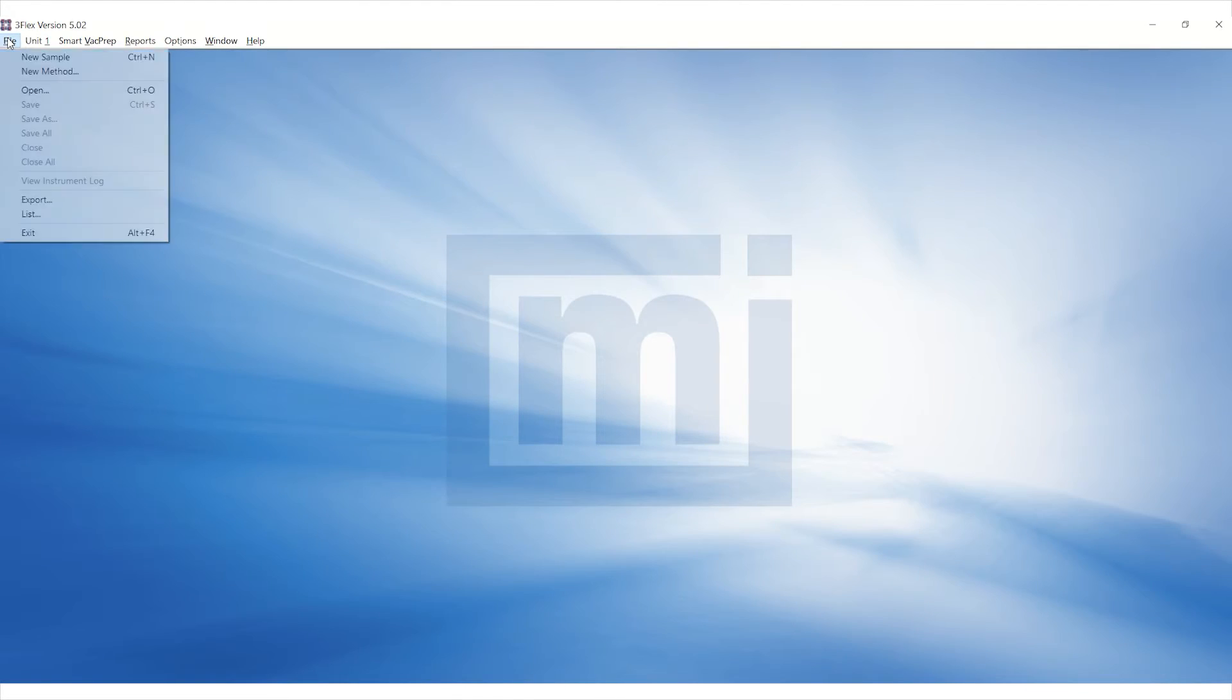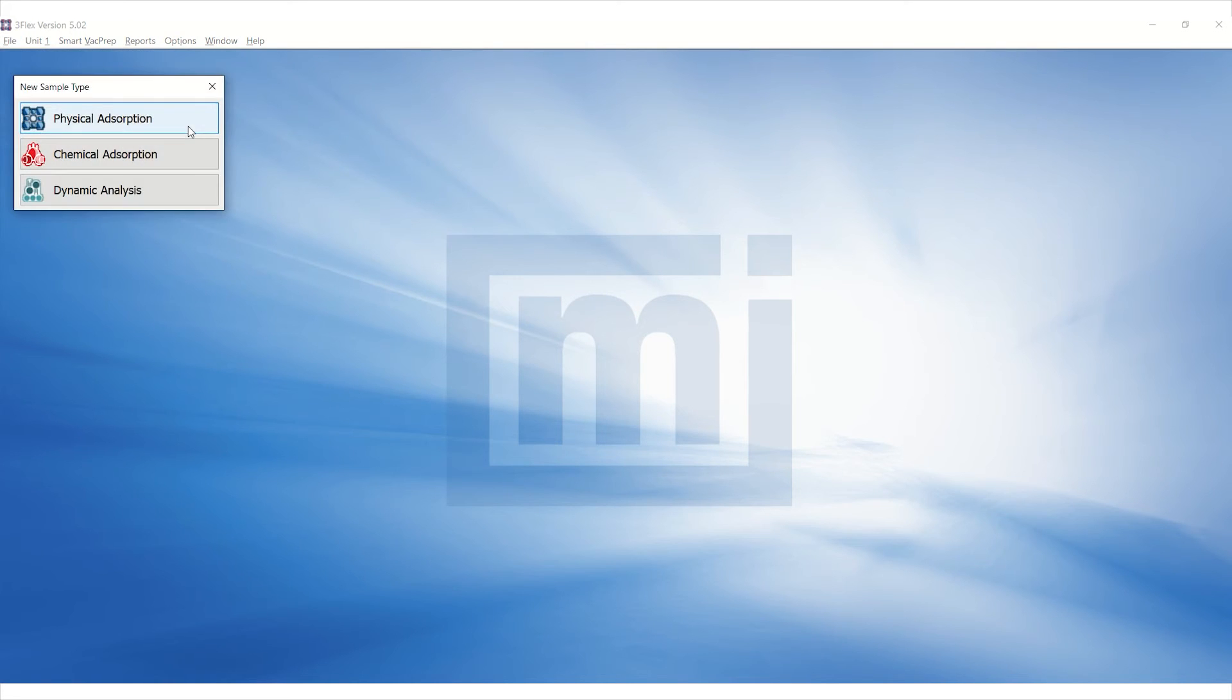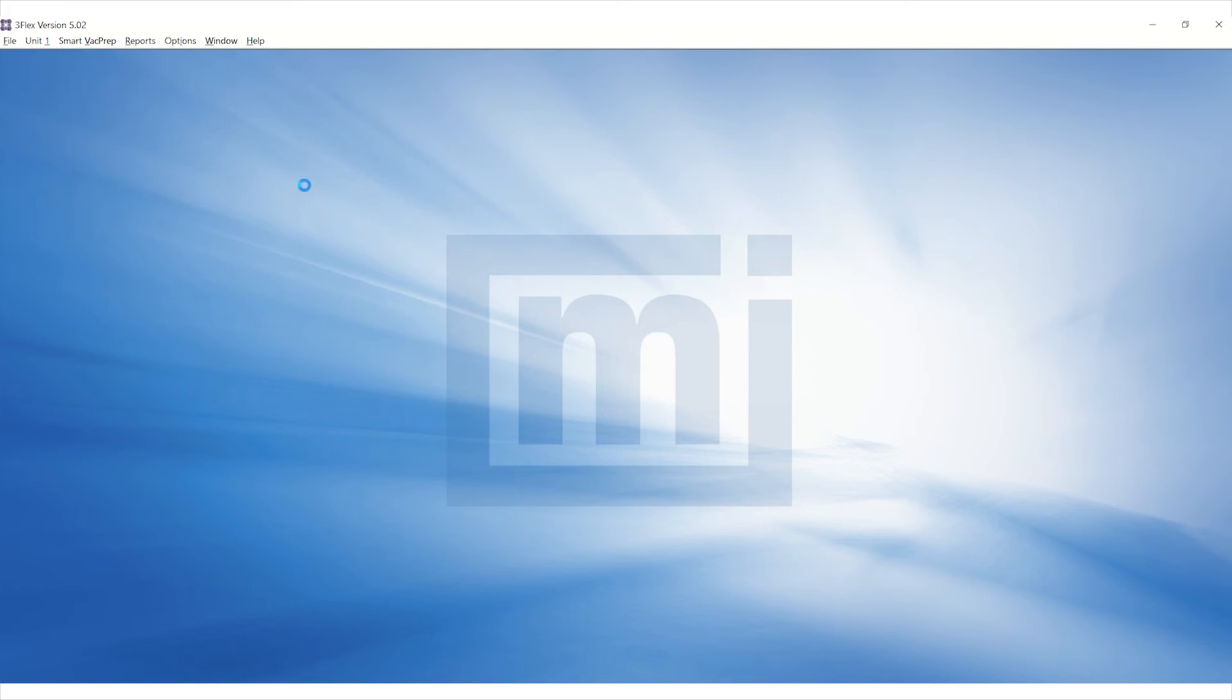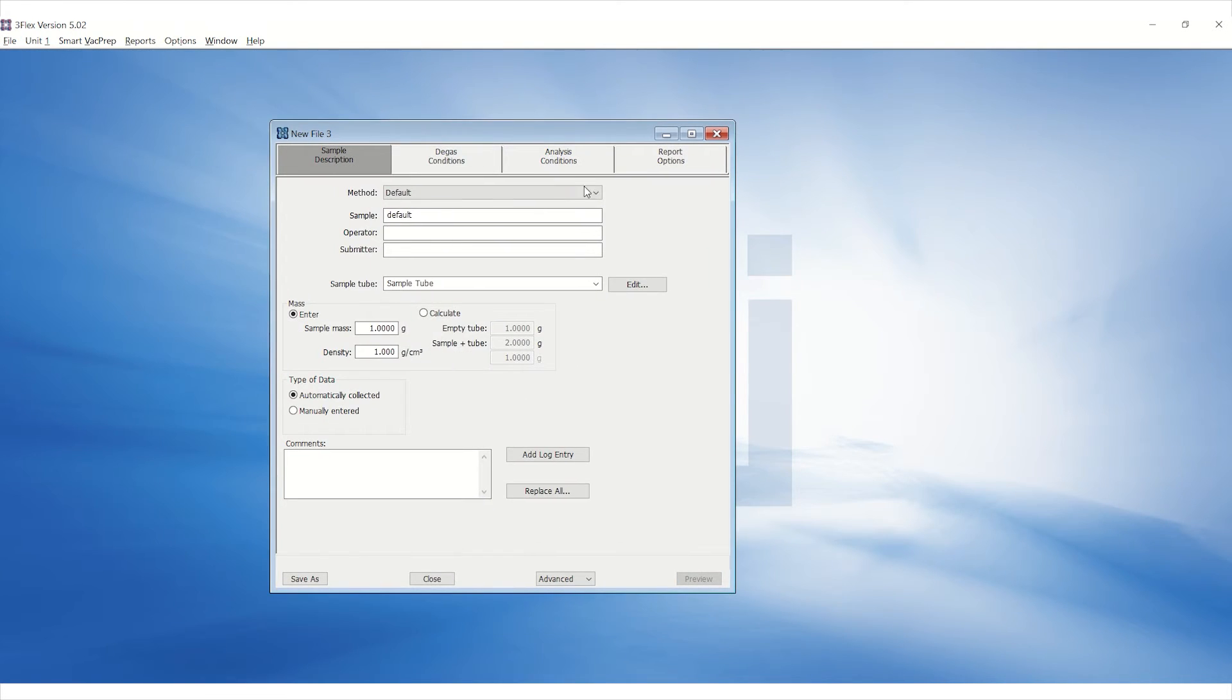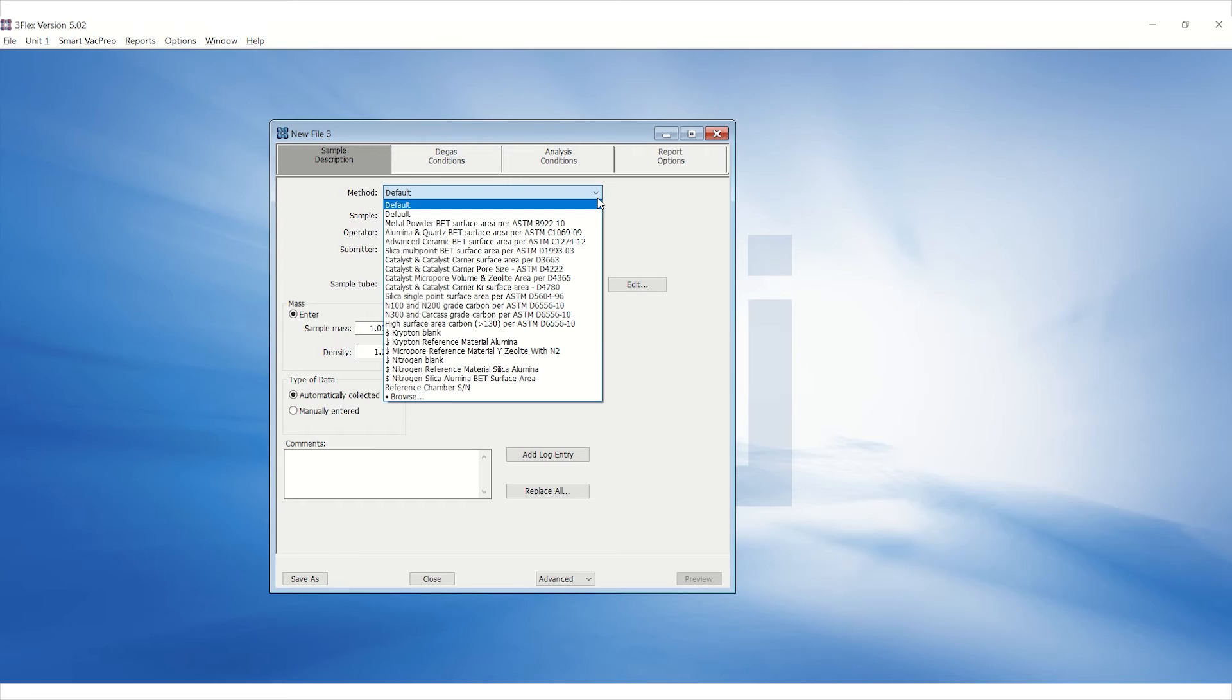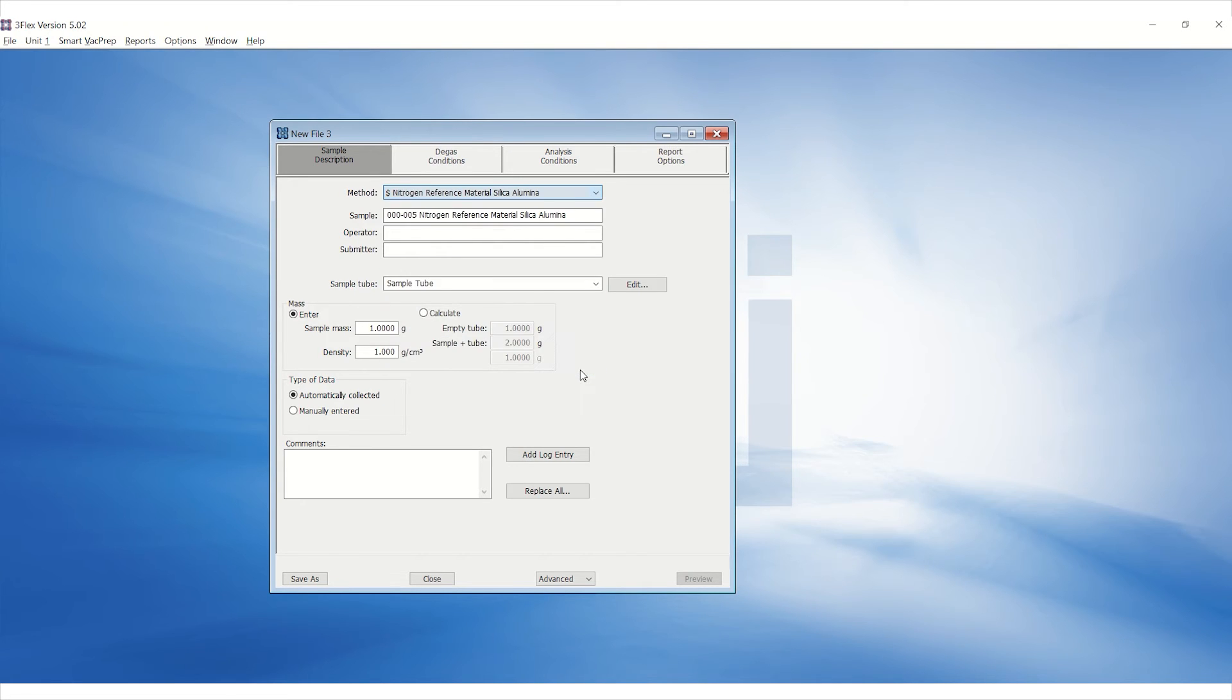To create a sample file, go to the File menu and click on New Sample. Select Physical adsorption for the new sample type. Click on the Method drop-down box and select Nitrogen Reference Material Silica Alumina.